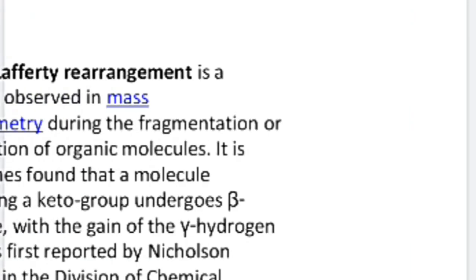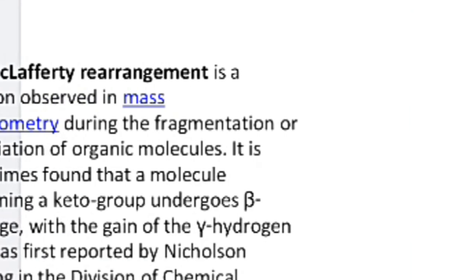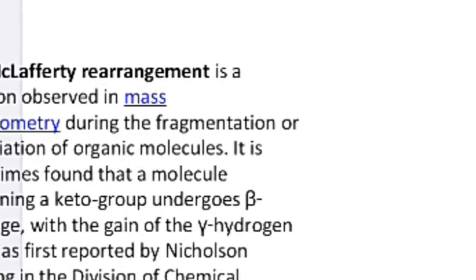I expressed the fundamentals and some basics of mass spectrometry: the advantages and uses of mass spectra, some examples like a general example and toluene, and the definitions of molecular ion, base peak, parent ion and M/Z value.